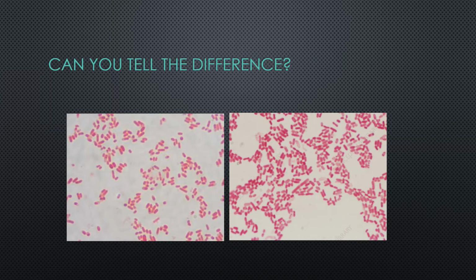If somebody had just given me two microscopes with bacteria and said, "What are they?" I probably wouldn't be able to tell either. The point is that many bacteria look a lot alike if we simply stain them. Staining, even if we do multiple stains, isn't enough to necessarily help us distinguish among bacteria. It can help, but it isn't enough.